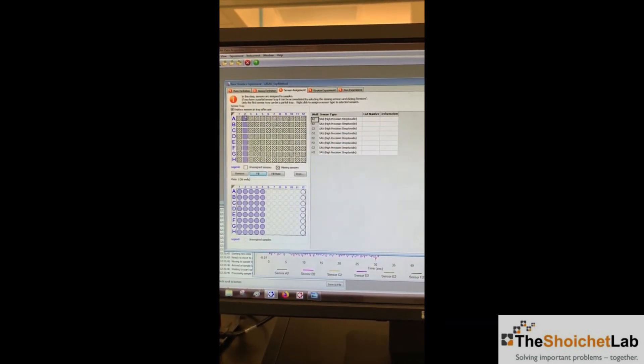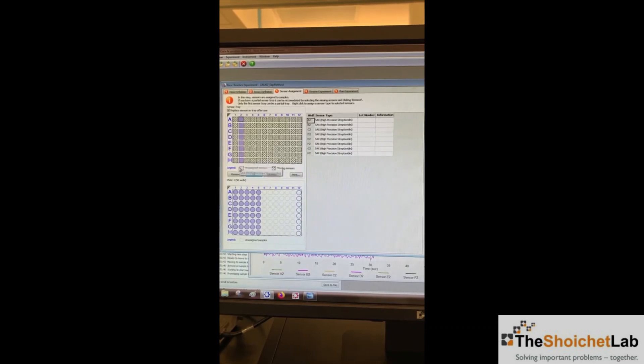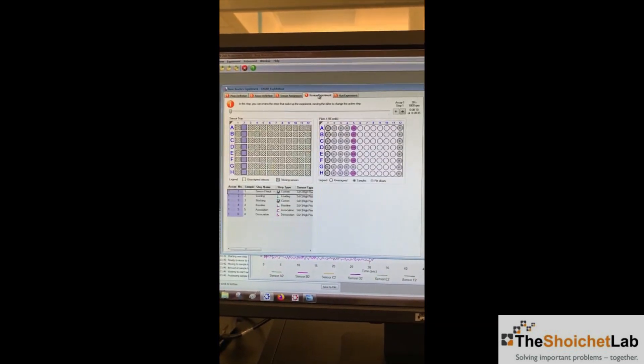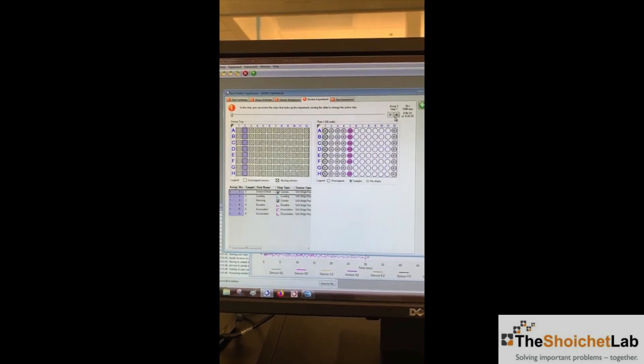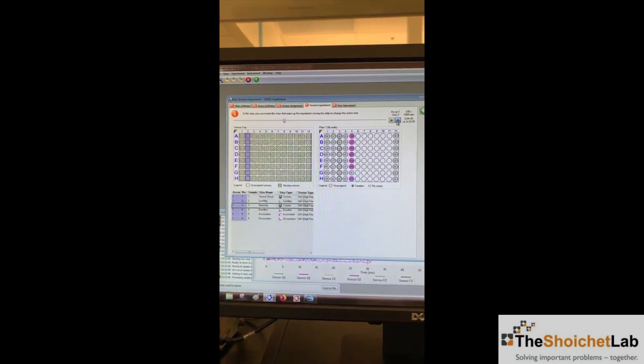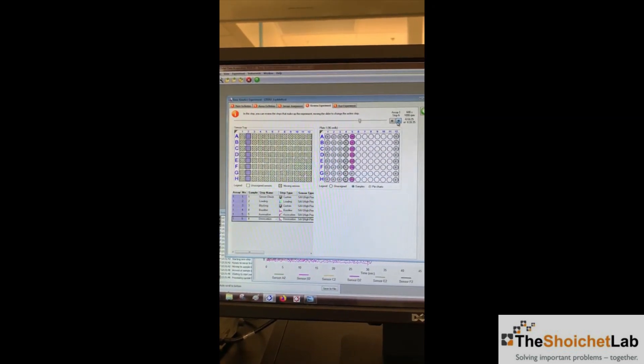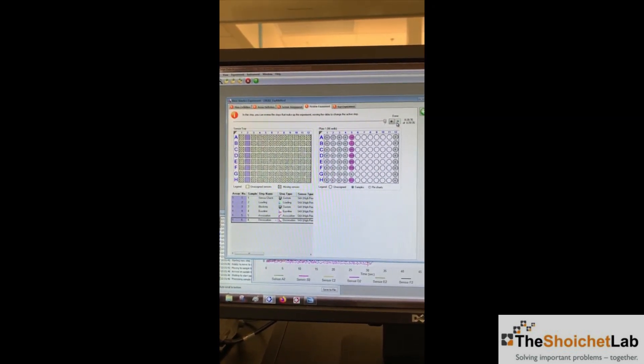We then check and verify that the sensor is going to the right wells for the right amount of time and in the right order.